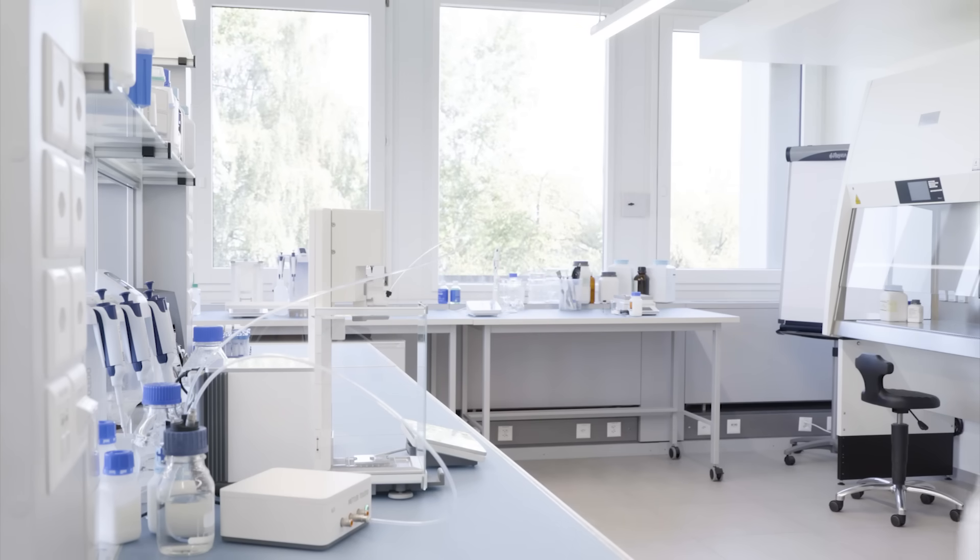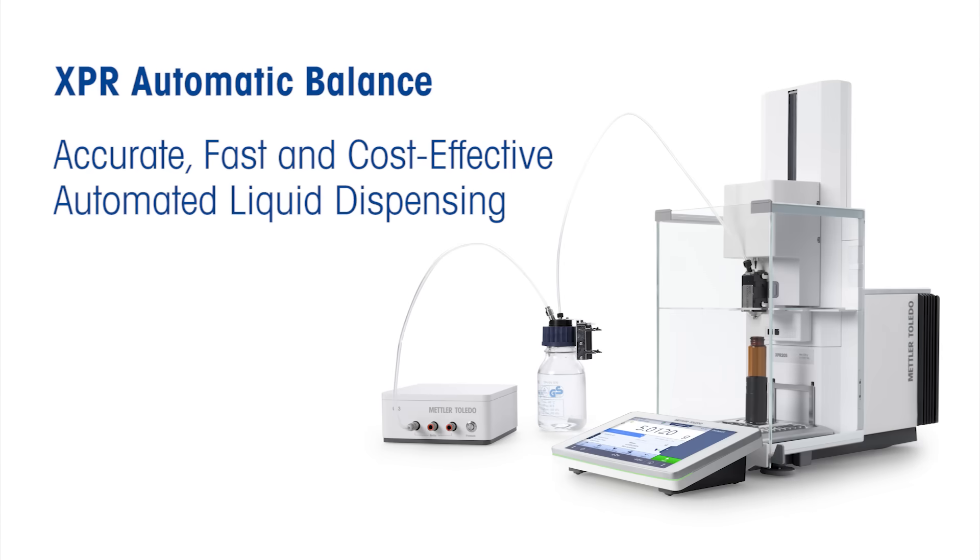Make the switch to automatic weighing today and enjoy accurate, fast, and cost-efficient preparation of solutions.